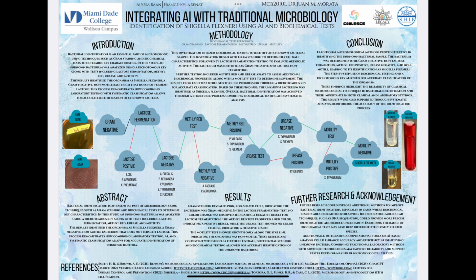The step-by-step use of biochemical testing with the help of the dichotomy key allowed for accurate classification of the organism. These findings highlight the reliability of classical microbiologic techniques in bacterial identification and their importance in both clinical and laboratory settings. The results were also supported through systematic analysis, reinforcing the accuracy of the identification process.